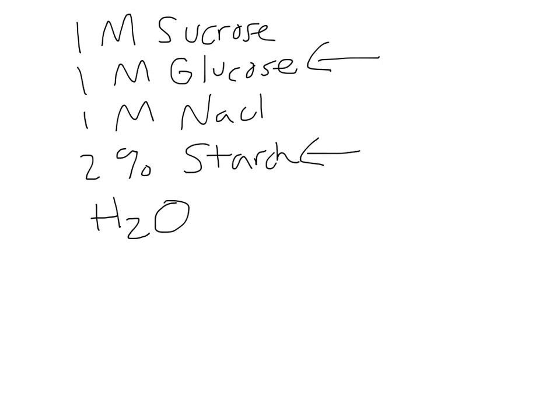As far as your salt, you're going to be using a conductivity probe. Basically, a conductivity probe measures the concentration of ions in a solution. We're going to be measuring sodium chloride, and that's going to be producing these ions when it's dissolved in water. So it should give you a reading whether or not it's diffusing through the actual membrane.